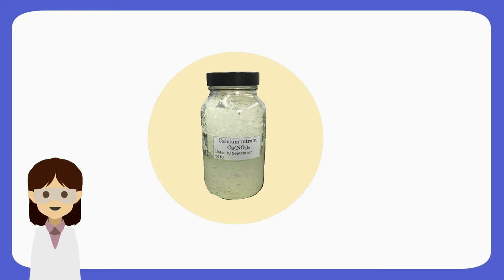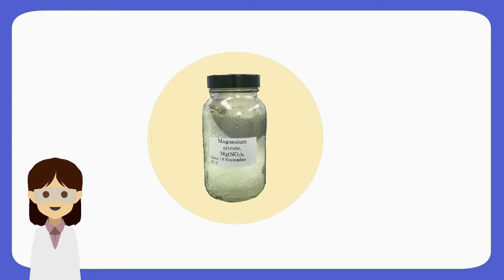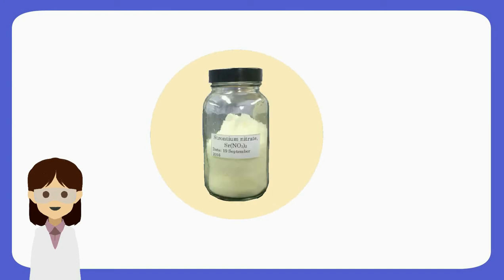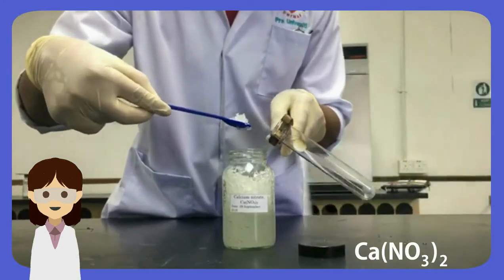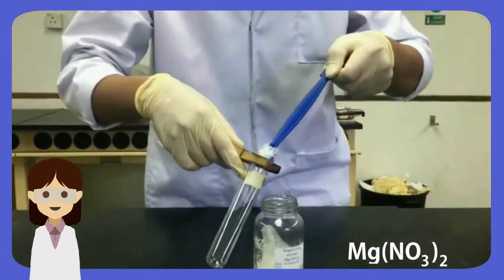First of all, we will use 1 spoon of hydrated calcium nitrate, 1 spoon of hydrated magnesium nitrate, and 1 spoon of strontium nitrate. And then, we will transfer the substances into a test tube.